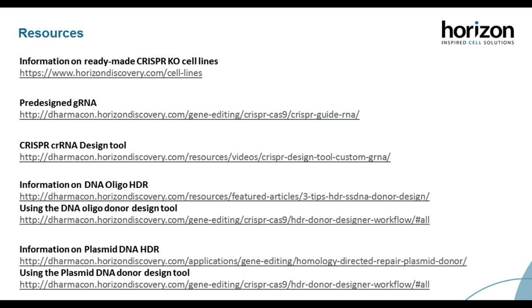So I really would recommend using guide RNA design algorithms that are constantly being updated and curated, and that would obviously be our design algorithm. But secondly, to mitigate the possibility of effects of off-target editing, one of the other things that we suggest people do is to use multiple clones or multiple different guides when looking at their knockout.